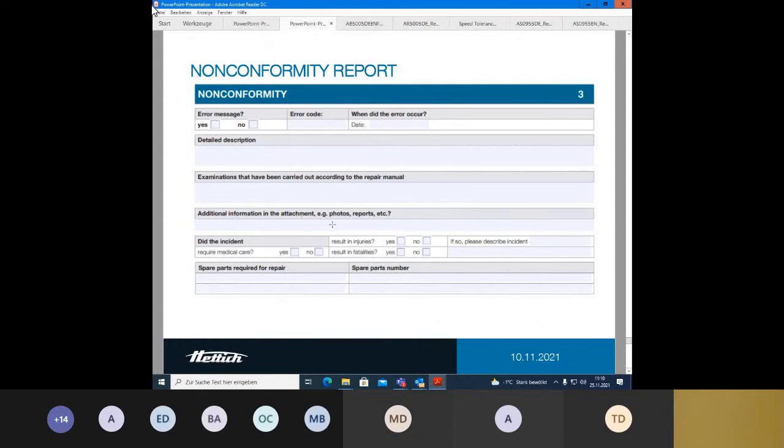You can send us pictures of the error or videos. Please don't share the videos or load the videos on YouTube. YouTube is not a share point. If you have videos, please write us an email. We can send you a Hettich share platform box and you can upload the videos and pictures on this.